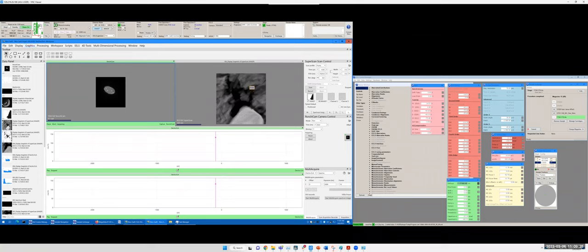So I have collected the beam. You can see the beam has been on for 1.5 hours. So you can see that the beam is no longer optimized. Now I want to click flash now to improve the beam current. How do I do that? I move the mouse here, left click, and watch what's happening.